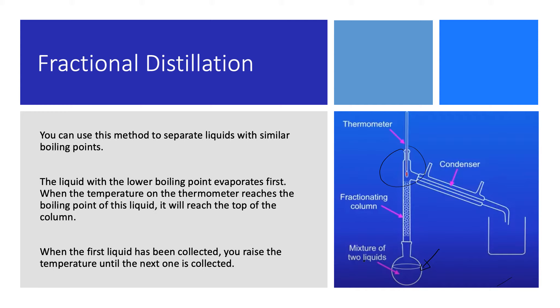In this beaker we have the solution — a mixture of two liquids. Unlike simple distillation, we have a fractionating column, which is filled with glass beads. The liquid with the lower boiling point evaporates first and passes through the glass beads, reaching the thermometer. The thermometer temperature has to reach the liquid's boiling point and remain constant. Once it does, the vapour passes through the condenser — just like in simple distillation — and one of the liquids is separated.